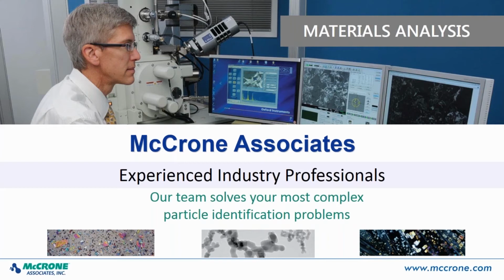And you can choose any colors you want. So let's say you pick blue and yellow. That'll allow you to have yellow particles on a blue background or blue particles on a yellow background, but you can make those any color you want. It's used as a contrasting technique or just for aesthetics, just to make it look pretty.